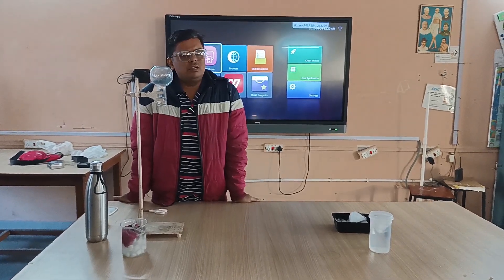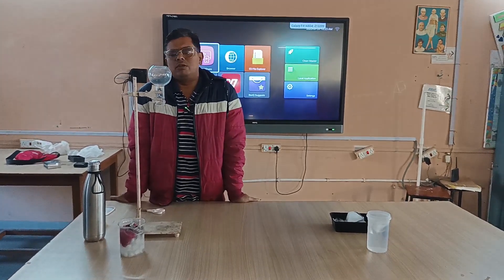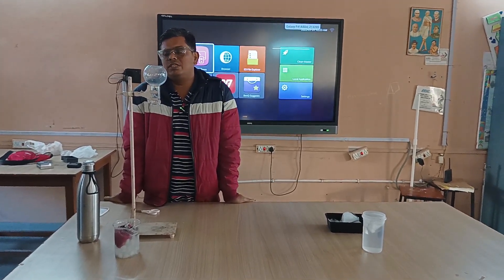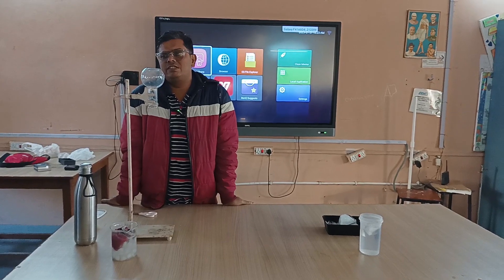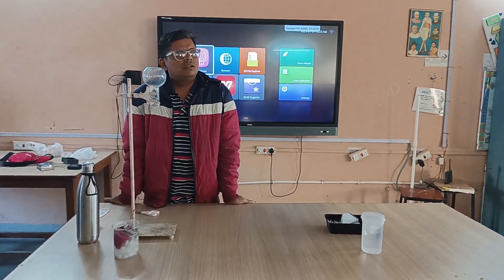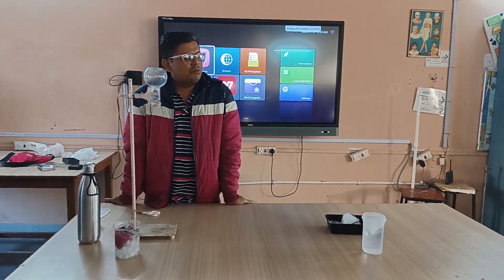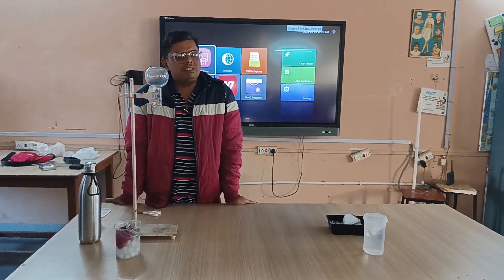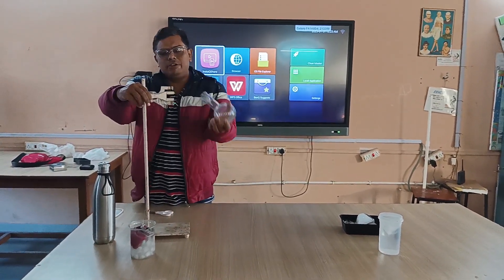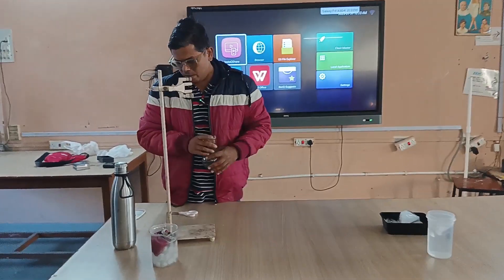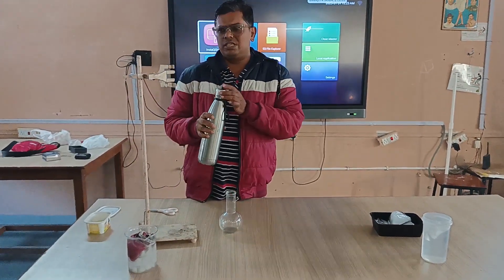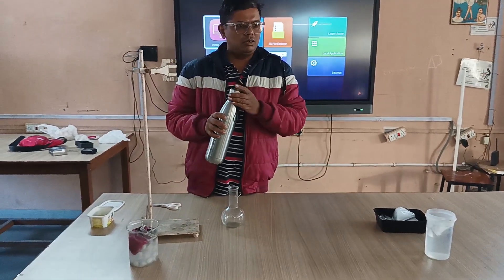Generally for water, it boils at 100 degrees Celsius because at 100 degrees Celsius the water vapor pressure and the atmospheric pressure become the same. So for that I take here one round bottom flask, and in that I add some water, and that water is somewhat hot.